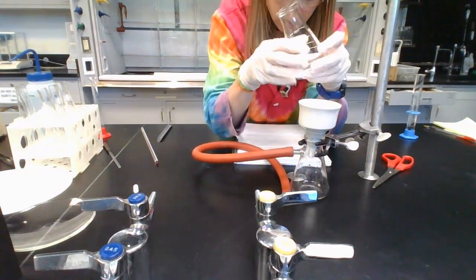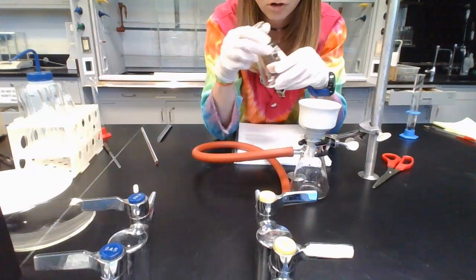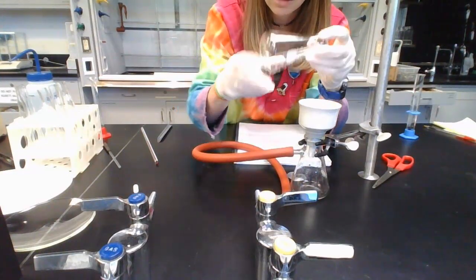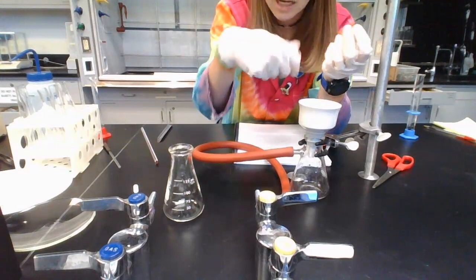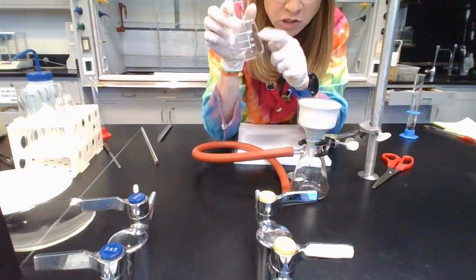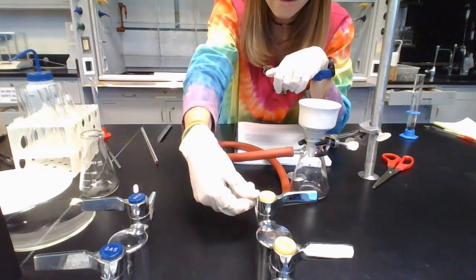Okay. And then what we're going to do is take some more of that ice cold water, pour it in the Erlenmeyer flask, swirl it, pour it out into here, trying to get all the solid from there. Okay. And actually, I guess you didn't have to stop it at that point. We're trying to get all the solid in there. Once we get all the solid transferred, or as much as we can, where this is completely clean, there's nothing left in that Erlenmeyer flask, that's when we will shut off the vacuum.